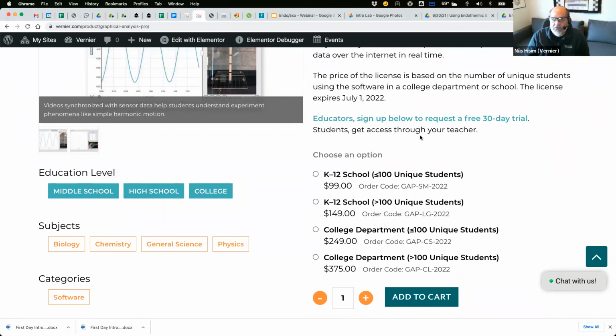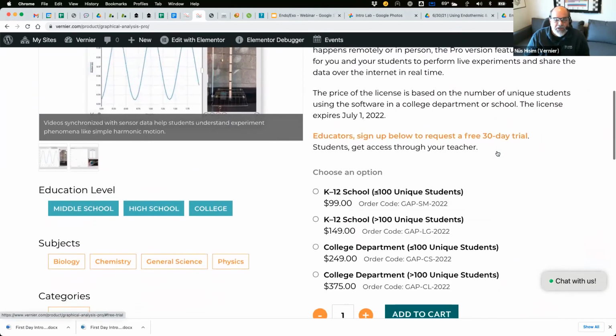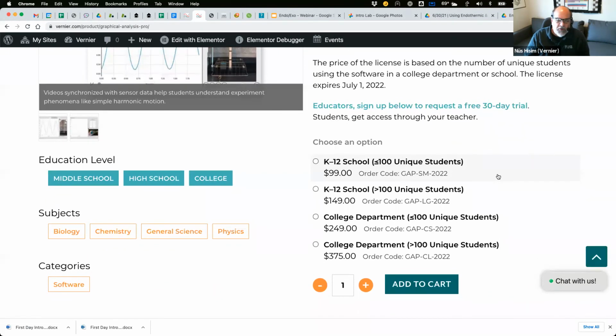Questions about sensors? Can you only do temperature probe with Graphical Analysis Pro? It's a rhetorical question. Of course not. The next workshop we're planning is gas laws. We're talking about doing gas laws in a jiffy, and I'm talking about all of them, folks: Gay-Lussac, Charles, Avogadro, and Boyle. We can do data collection with a pressure sensor and a temperature probe connected simultaneously. We can do a titration with a drop counter.